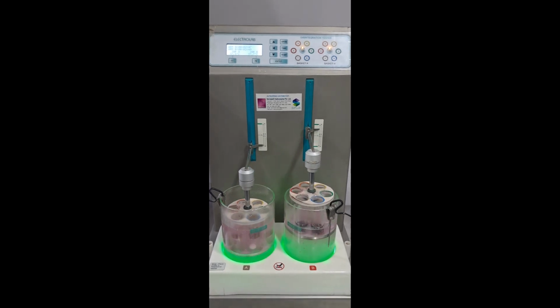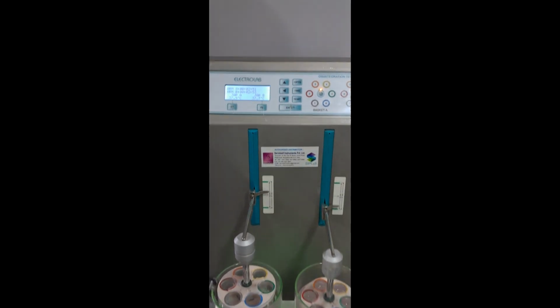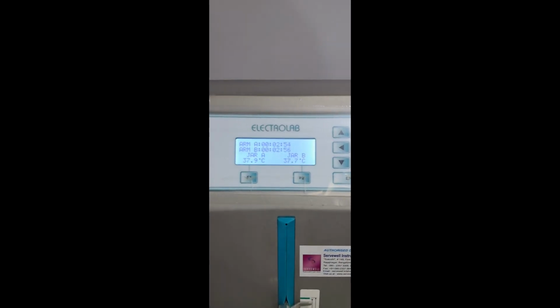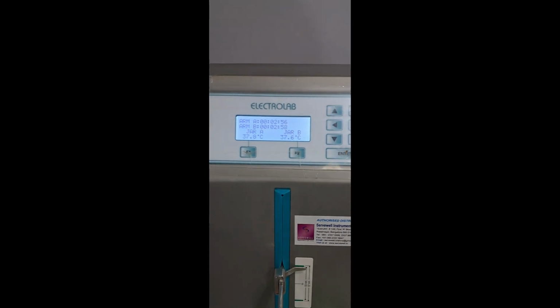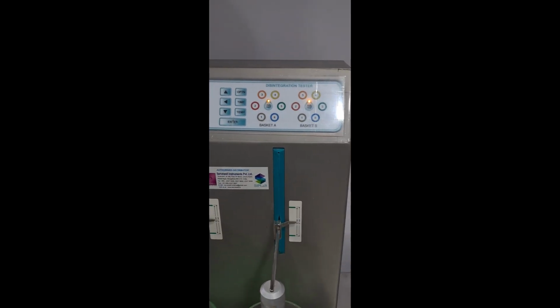Prepare the right volume, usually 1 liter, of test fluid, water, buffer or biorelevant, at specified pH. Degas or filter if required. Air bubbles alter wicking.